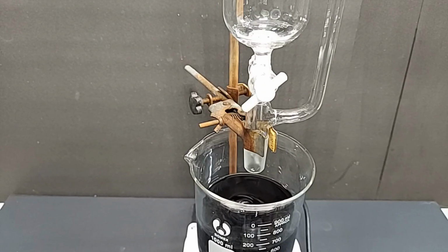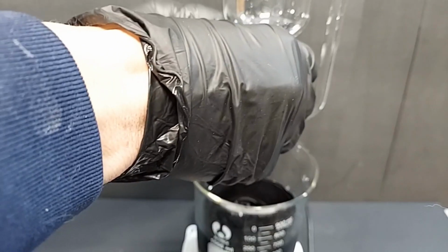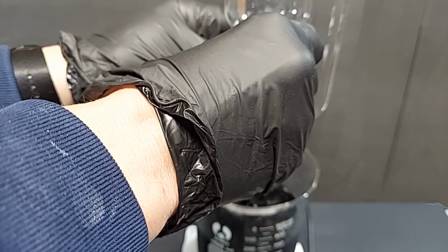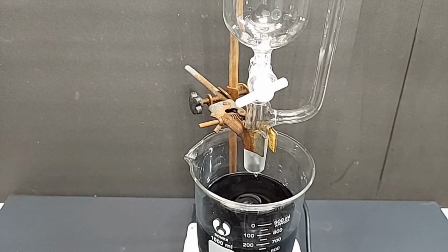Taken about an hour to add almost all of it. There's a tiny bit left in there. At this point, it doesn't matter if I just let it all go because that's already been diluted really well on the bottom, so I'm going to do that. And we're done. Next, we need to now dehydrate that solution.